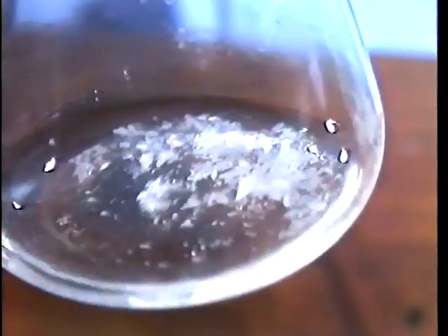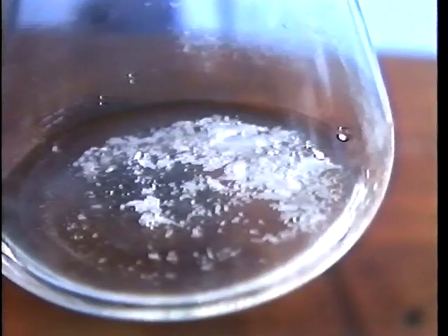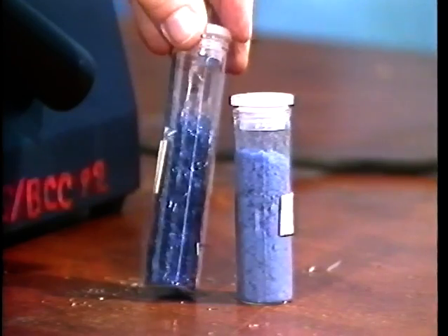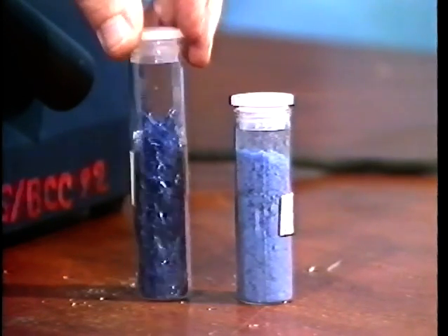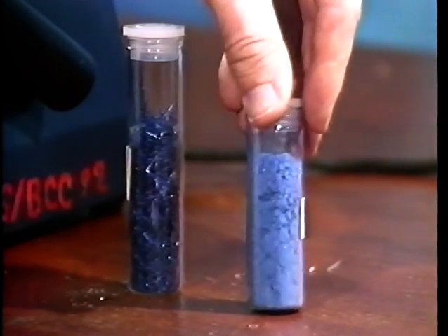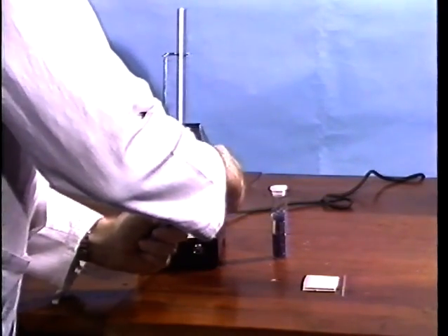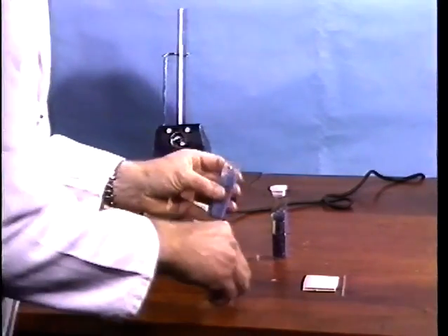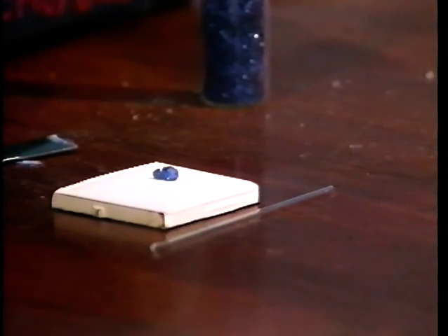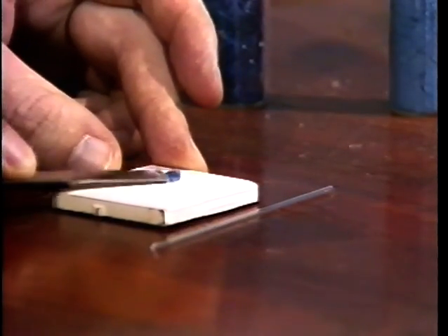Again, these rather large crystals are the result of a slow crystallization overnight. Large crystals do not necessarily mean a purer compound, because solvent and impurities can get trapped in the crystal lattice. The purity of a product is determined by the melting point. In order to measure this, put a small amount of your solid onto a porous tile and crush it with a spatula.